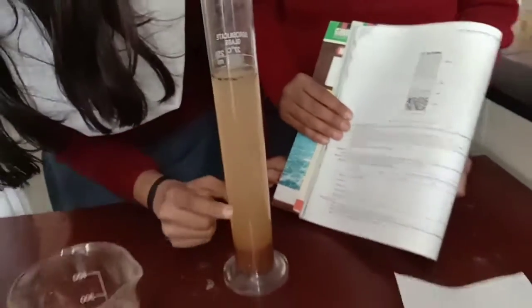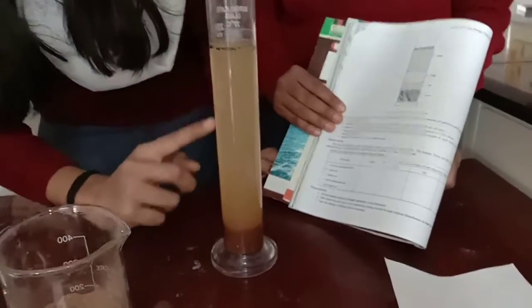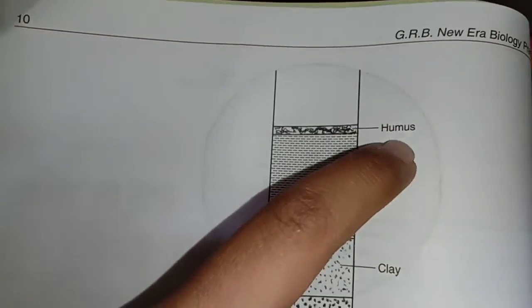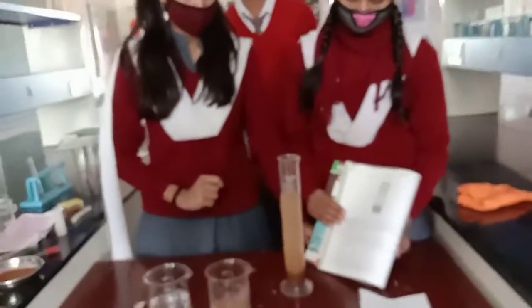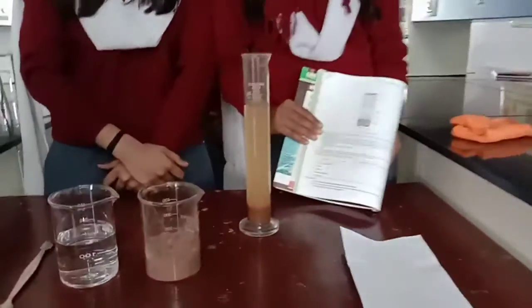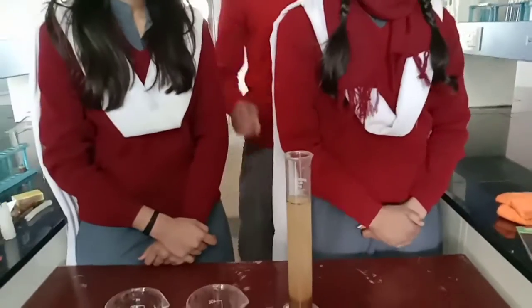Now this is the water, and on the top you can see floating particles like this. This is our humus. We can see here that the heavy particles have settled down first and the lighter particles have settled down afterwards, and humus floats on the water surface like this.